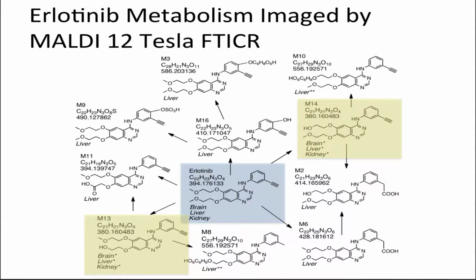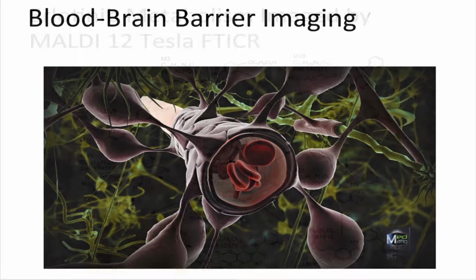So using that technology, we were able to look at, I think, about 10 to 15 metabolites of Erlotinib in the different organs, including the pharmacologically active metabolite.